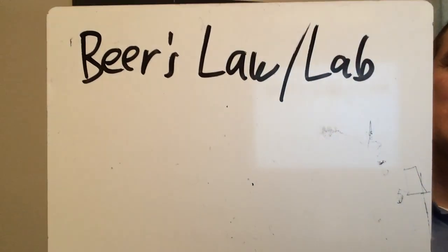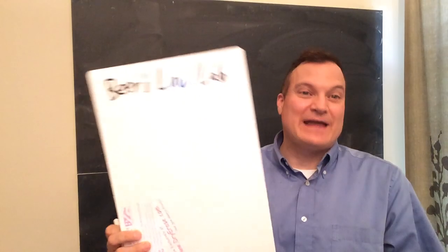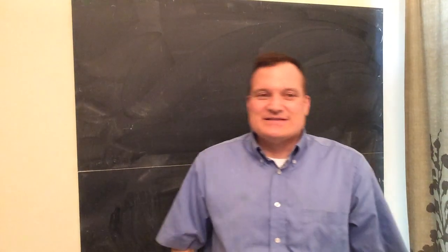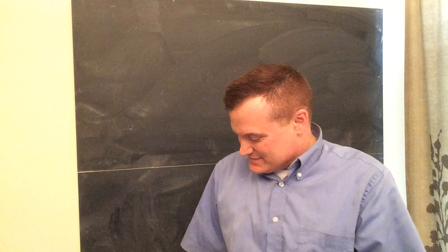All right, Beer's Law Lab, and Beer-Lambert is the name for it. I'll see here, Beer's Law Lab, Dry Lab. Okay, this is one of the first ones we're going to do, a dry lab. I'm going to have you try and do this the best you can. There's a couple of reasons.